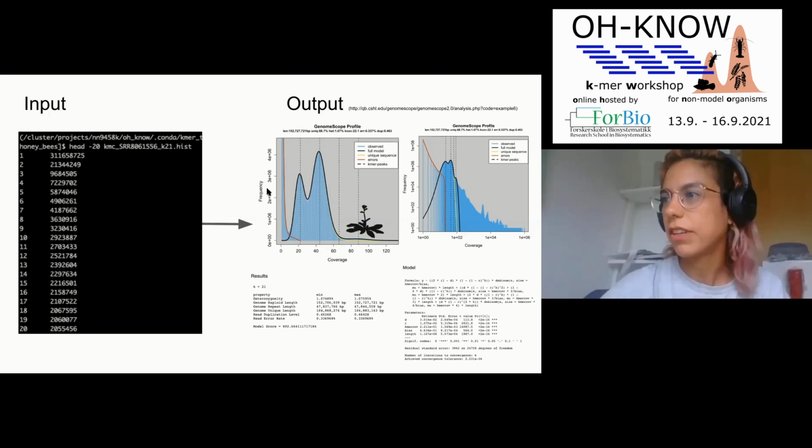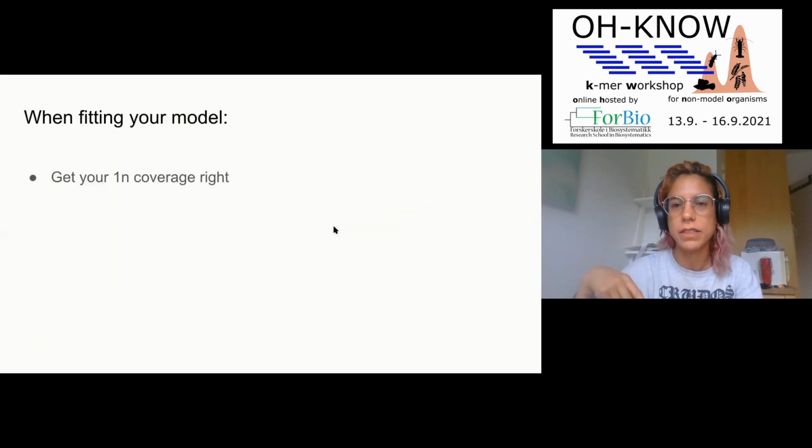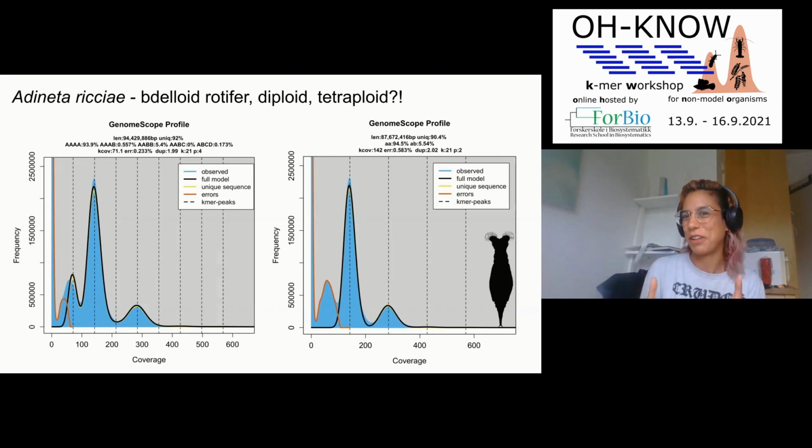I also have kind of a question or maybe comment related to your previous example of the rotifera. Could it be that the difference between the genome size that you estimated with the Kmers and the flow cytometry results is due to the repetitive content, or the amount of repetition in the genome? Because with the flow cytometry, you're measuring how much of the whole mass is there, and with the Kmers, you're counting how many different patterns you find. Is that possible?